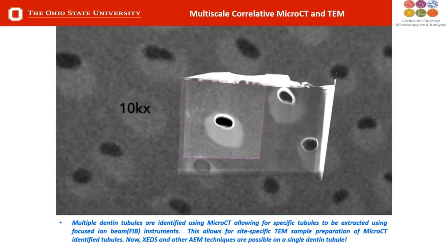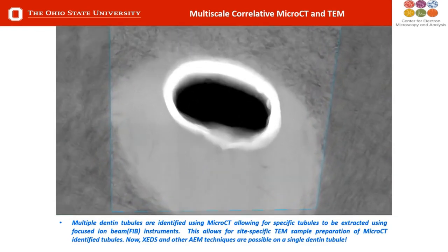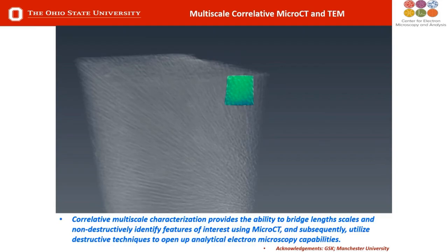And now you see this very bright circular region, or bright casing, on the interior of your pore. That is indication that we have Sensodyne actively working here. Now we doped the Sensodyne with strontium in order to control our experiment and be able to identify this more clearly. But the concept here is you can take a HeliScan image in order to find features or defects of interest and then go in and remove them very precisely so that you can characterize them with other methods.